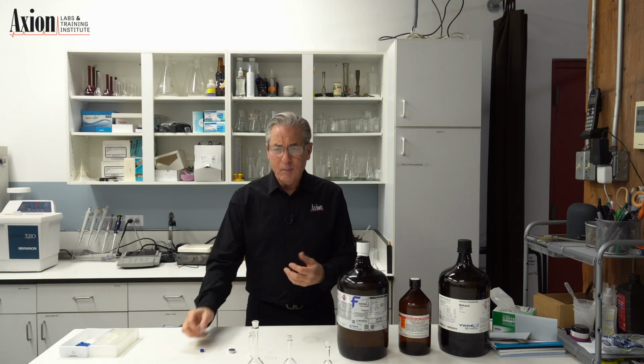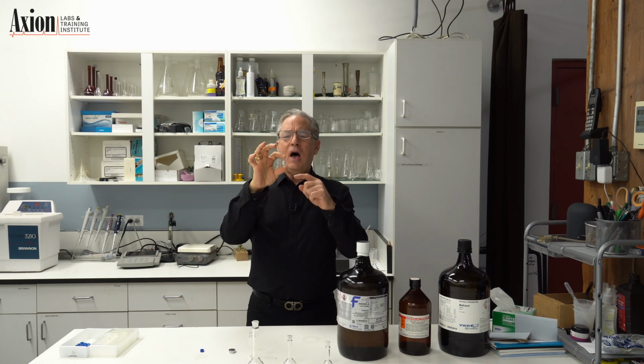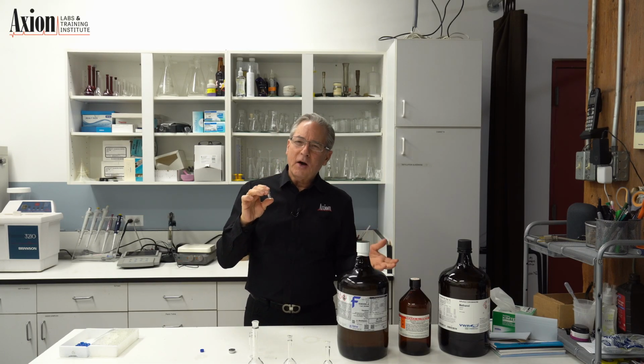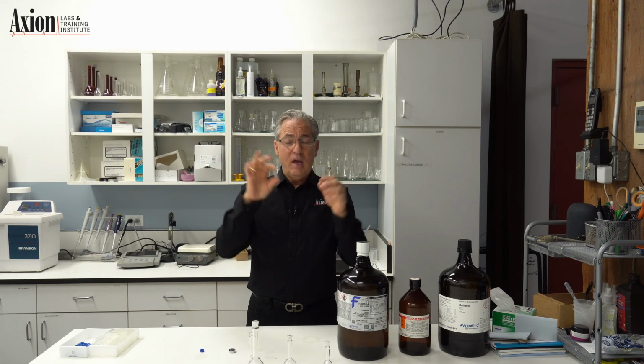So typically, you're going to make up your sample, and you're going to put it into a 2 mil vial. Now, they're actually 1.8 mils, but we call them 2 mil vials. This is the size that all HPLC and GC autosamplers will take, the little 2 mil vials. You need at least half a mil for the autosampler to do its thing. So I prefer to have 1 mil in these vials, maybe 1.5 mil, because if it's too far down, depending on your autosampler, the needle may not reach it. And that's a miserable thing to troubleshoot, to try and figure out why you're getting no peaks because you're actually getting no sample. So at least 1 mil in these vials, and life is good.